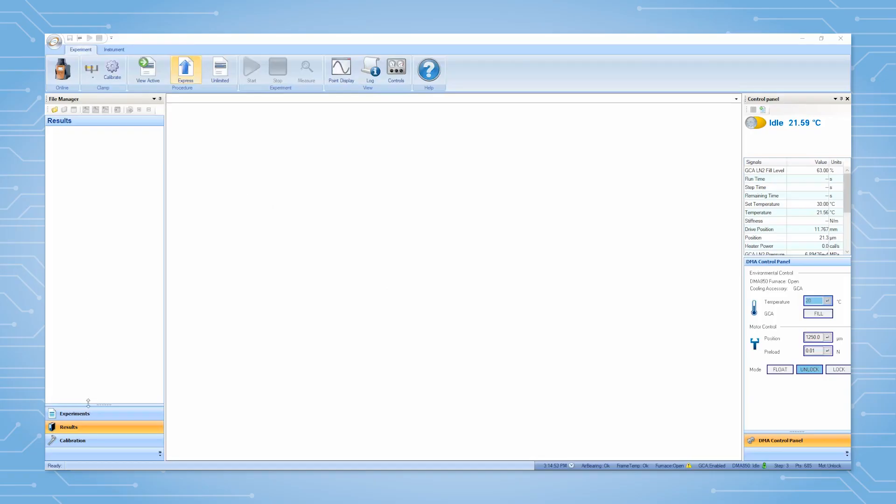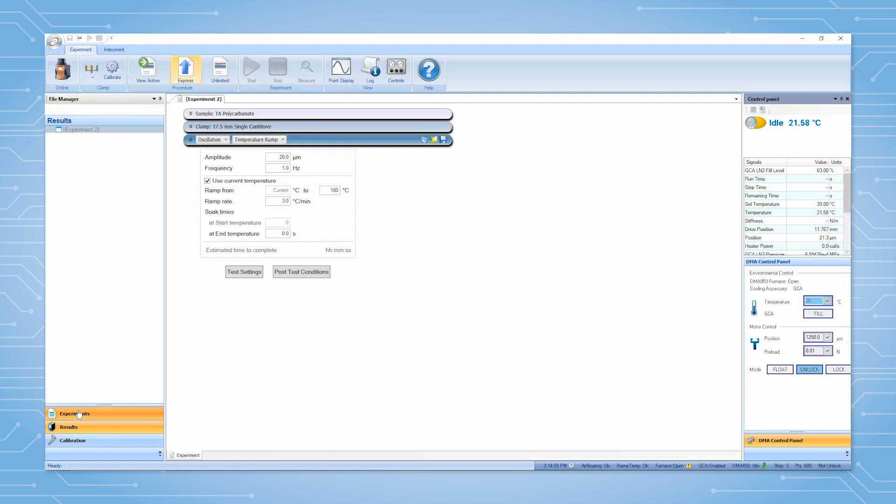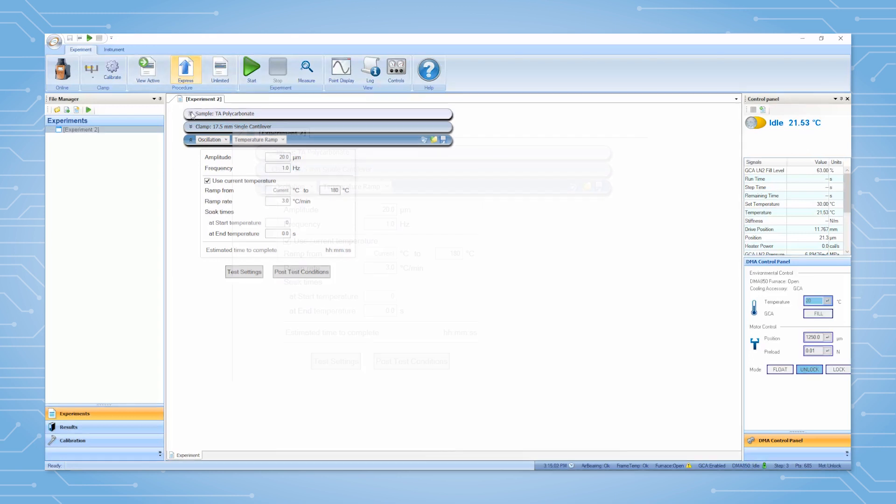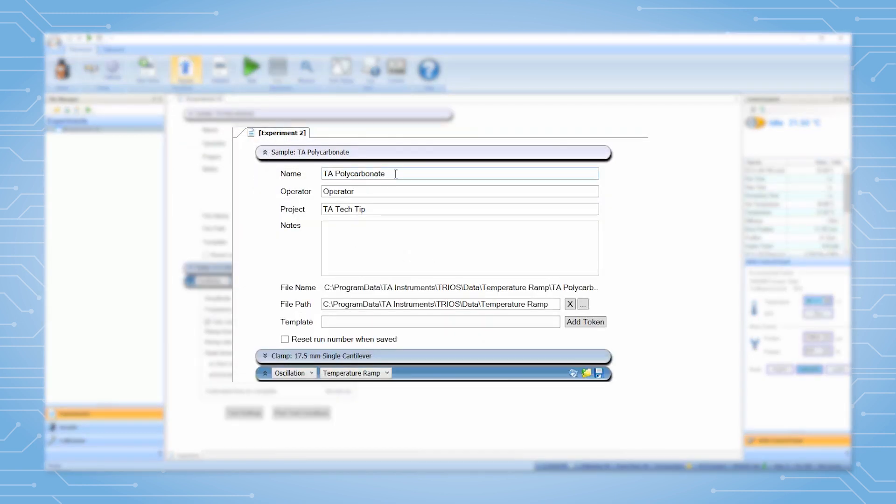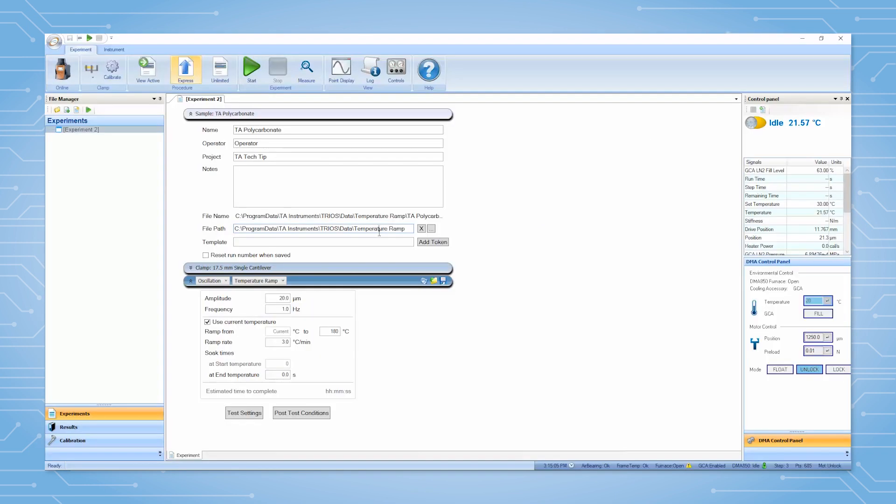To begin an experiment, click experiments under the file manager. For a simple experiment, select express mode. First set up the name and file path and any other details.